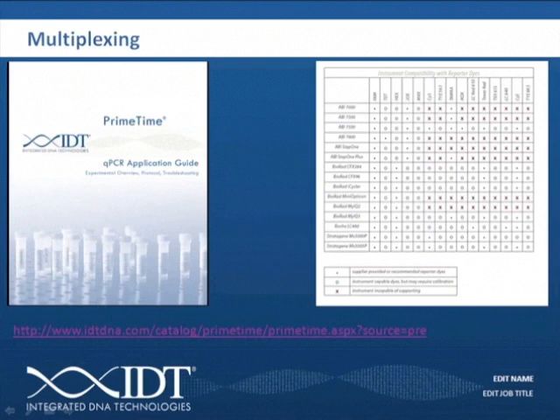Okay, so you've said MGB. What's MGB? I'm not sure of that one. So MGB is a minor groove binder. It's licensed by ABI and sold exclusively through ABI. It helps to raise the TM of probes, but it's not needed in terms of functionality of the assay. You can design dual label hydrolysis probes, and as long as you design them longer to account for sufficient TM, for gene expression, it's not needed.